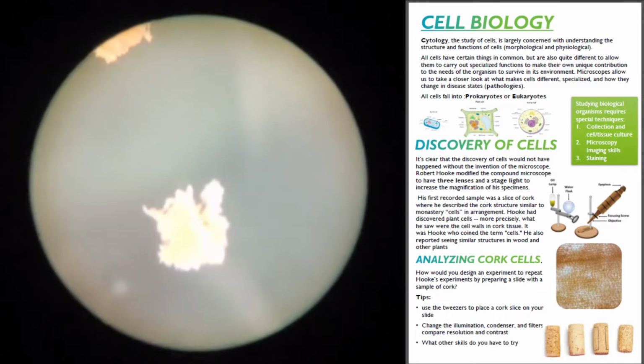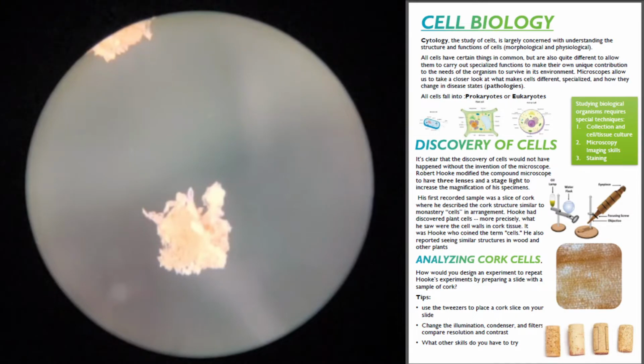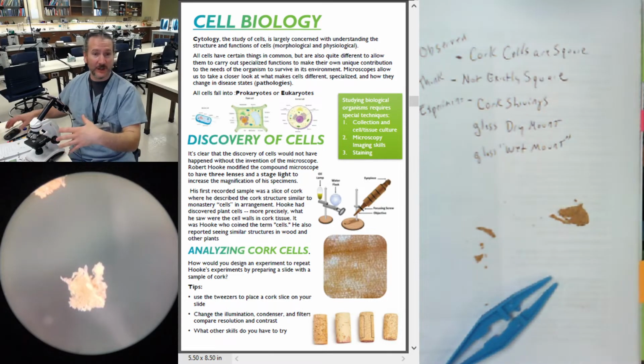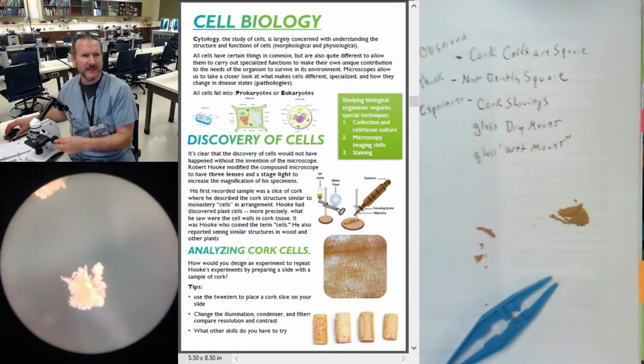That's better. So what I just did is, you may not have noticed, is that I have a bright light. You can see how bright it is coming from right there by the camera. And it's actually washing out my stage when I flip on my overhead light. So I turned off my lights on my microscope, and this is good enough.